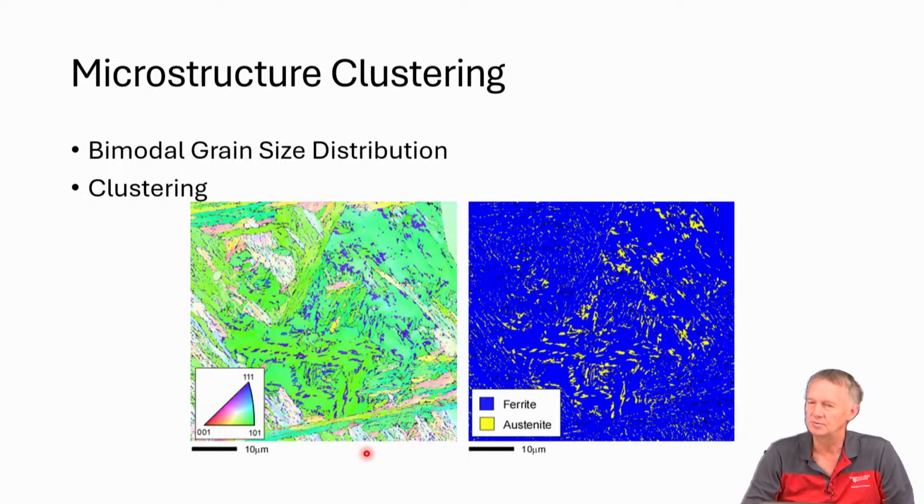Yeah, okay. This is very good. Yeah, it looks nice. You can usually pick out retained austenite reasonably well.